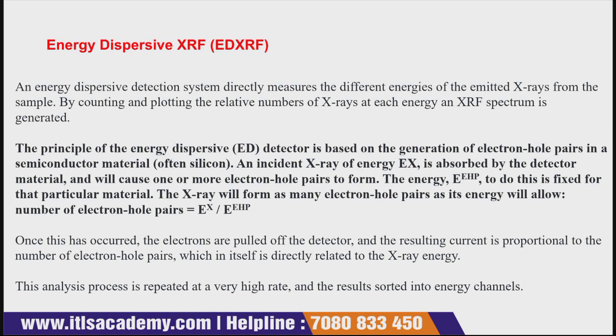So what do you understand by energy dispersive X-ray fluorescence spectroscopy? Energy dispersive spectroscopy makes use of the X-ray spectrums emitted by a solid sample that is bombarded with a focused beam of electrons to obtain a localized chemical analysis. Okay, so now let us discuss this in detail.